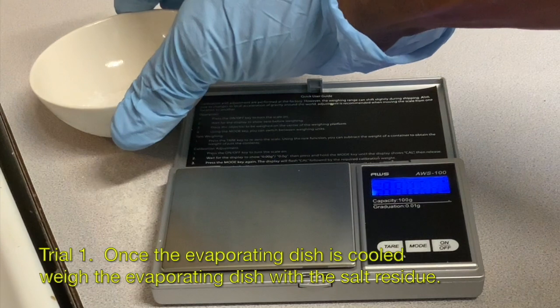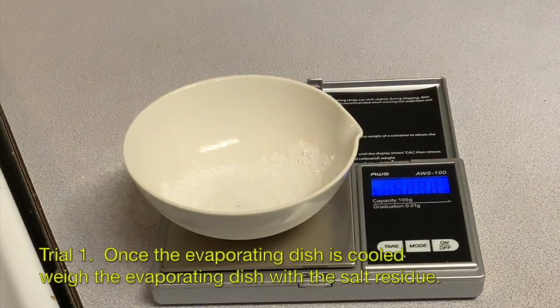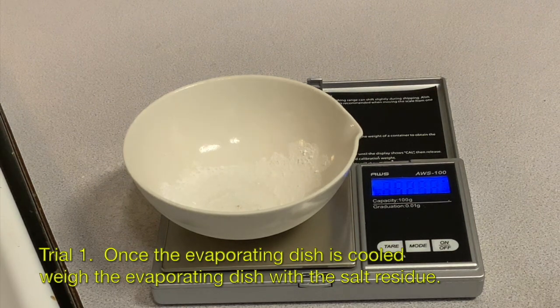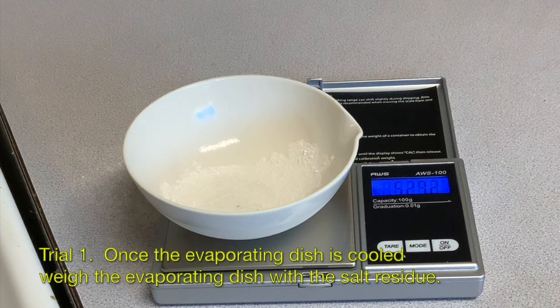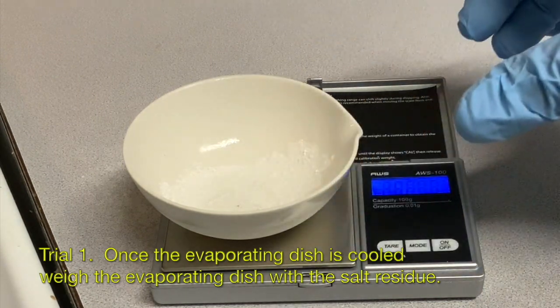And then place your evaporating dish and the residue and weigh the total mass. In this case, it was 52.93. Once you have the mass, then you are ready to do the second trial.